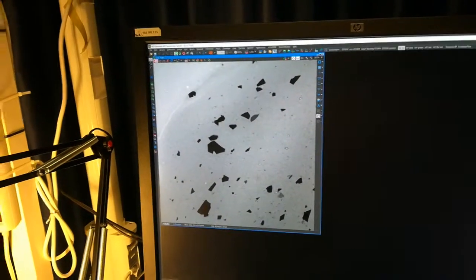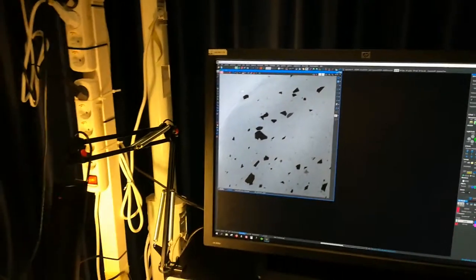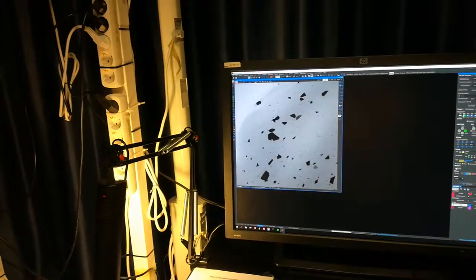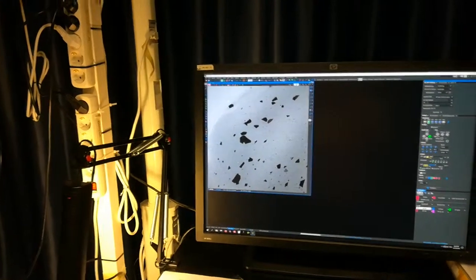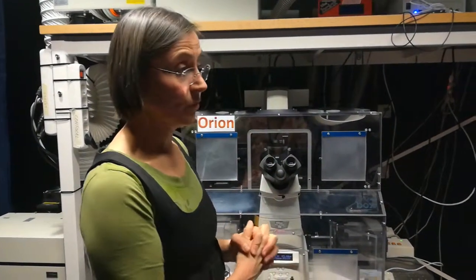So now we have Köhler'd the microscope. To summarize: number one, focus on your sample; number two, close the field stop; number three, focus the condenser; number four, center the condenser and then reopen the field stop; and finally, close the condenser aperture. Now you have a perfectly Köhler'd microscope and you will be able to get great bright images.